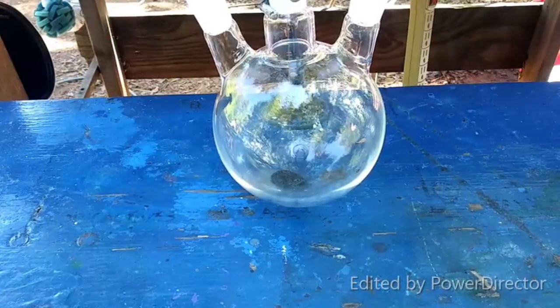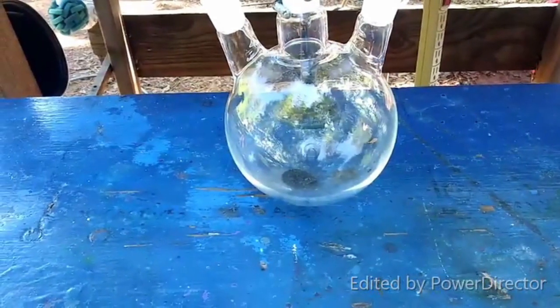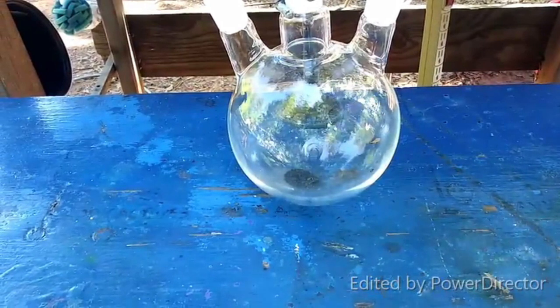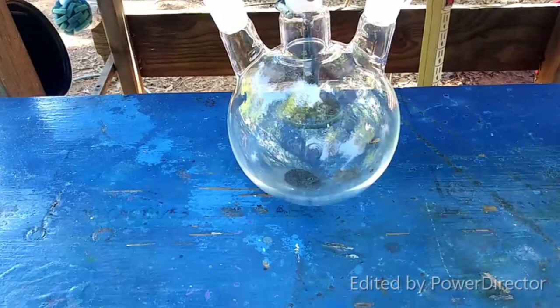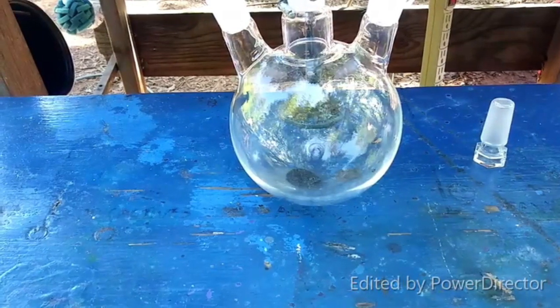The reason this is in such a big container is because I don't know if it's going to splatter all over the place or not. Not knowing that, I figured this would just be a safer way to go. When there's a lot of unknowns, proceed with caution.